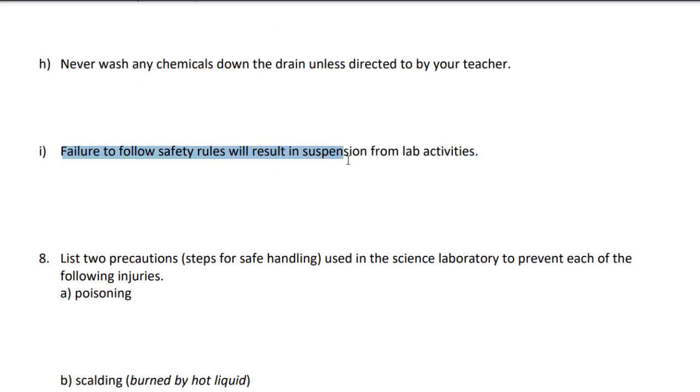Failure to follow safety rules will result in a suspension from lab activities. Why is that smart for me to do? Why should I kick you out of a lab? I don't want anyone to get hurt. So if people aren't following the rules, then we keep everybody safe by just telling someone to sit down and have a break. Now, if that happens, keep in mind, this is not just somebody horsing around and tossing stuff or breaking stuff.